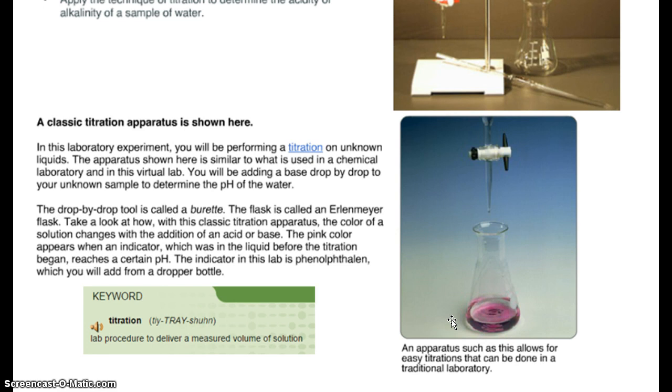The pink color appears when an indicator, which was in the liquid before the titration began, reaches a certain pH and then it changes color. So in here was a solution and some clear indicator called phenolphthalein, right there, phenolphthalein, and they were in there when we started. Then we added one drop at a time of the base, and we kept adding it until we neutralized the solution and then made it a base. When it's a base, it turns pink.